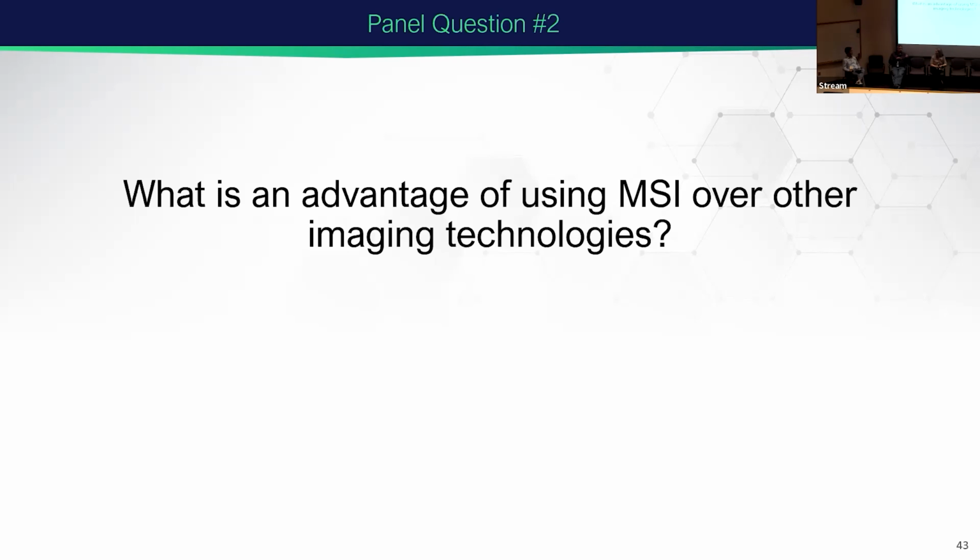And when I was a student here, I did some experiments where I put, for example, manure on one side of a chip and straw on the other. And you saw this amazing change in the amount of ammonium that was assimilated within a micron, so you can do experiments like that.